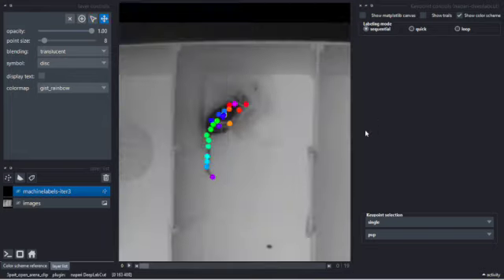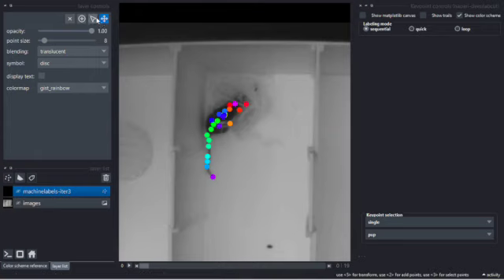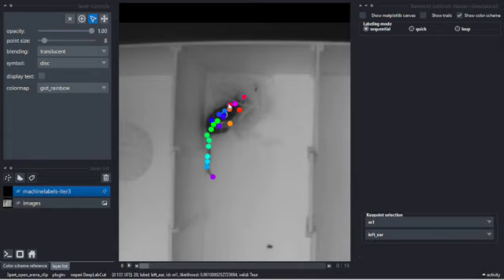And essentially what you're going to do is go through each mouse point and make sure that it's in the right area. If you cannot see the point, so like you can somewhat see the nose, I would say the nose is right there. You'd move the nose to where that should be. And this labeling mode is going to go sequentially through each point. But it is a little bit different when you are relabeling. So you can individually select ones.